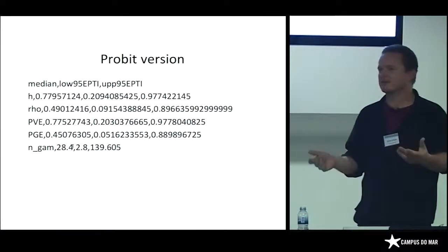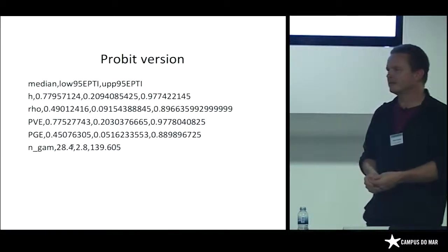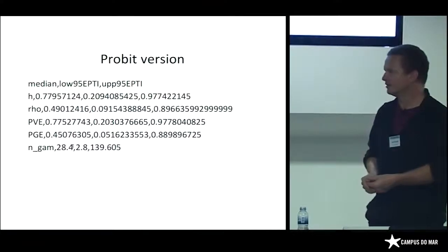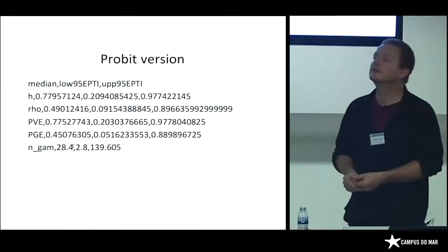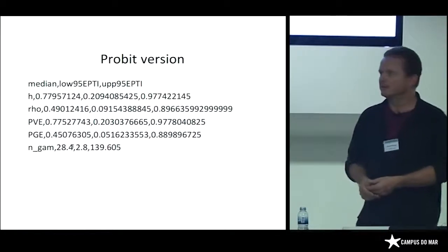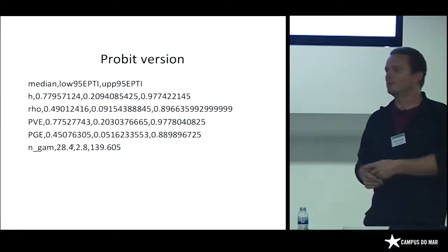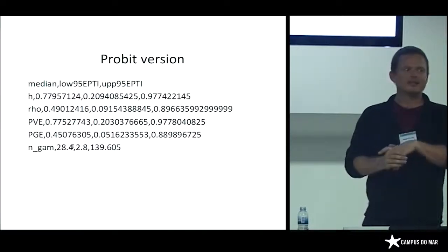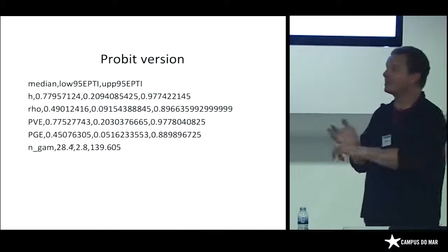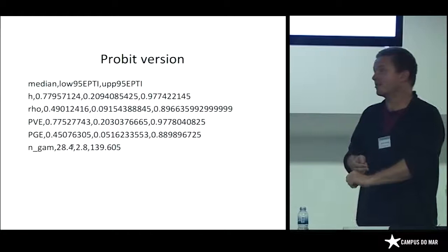You guys are the ones who are here to learn. Do you know something about population structure estimates? Yeah, I'm interested in association. So more association studies, structure. So we've still got mapping and SNP calling. Everybody confident that they can just do that, or do you want to go through that?